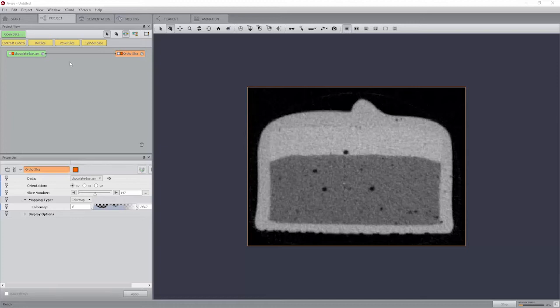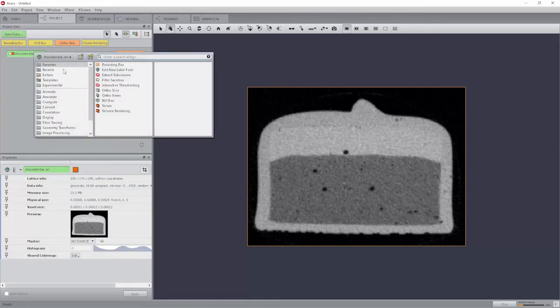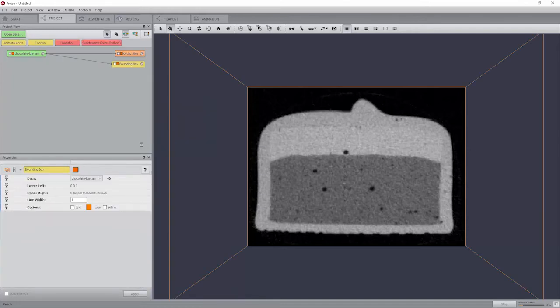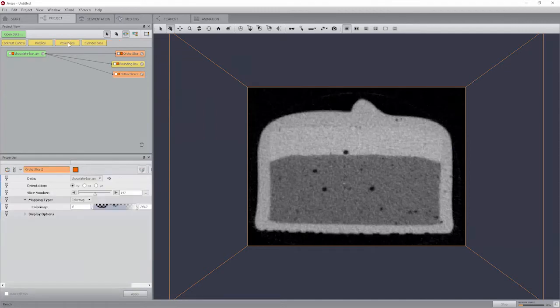Connect a bounding box module to the data. Use right mouse on chocolatebar.am. Connect an ortho slice module to the data. Connect a second and third ortho slice module to the data.